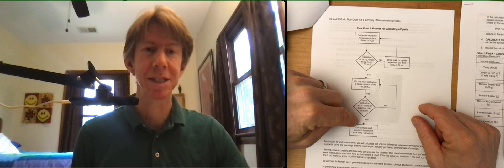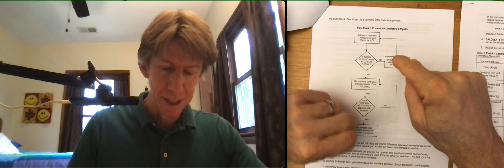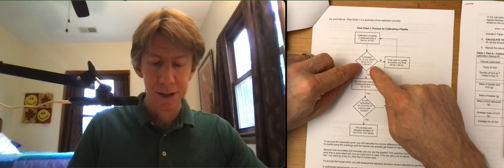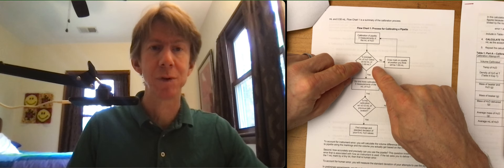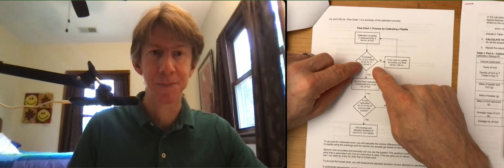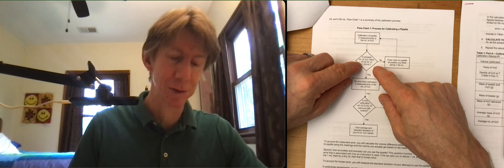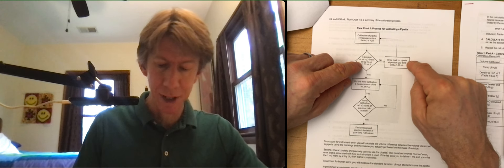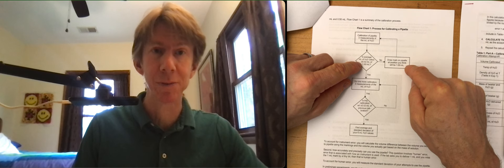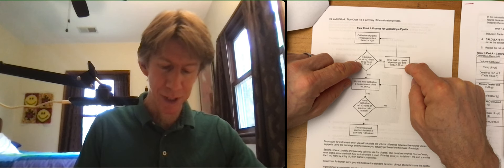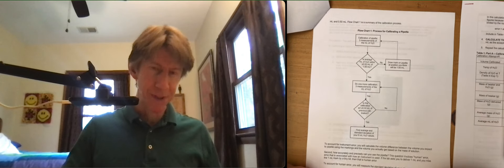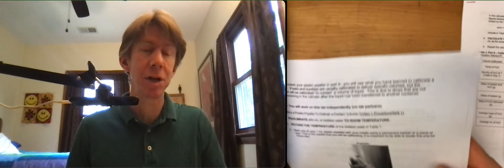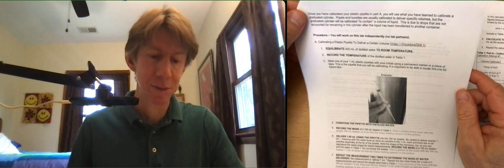Minimum number of measurements is six. If not, so if the first three are not within plus or minus 0.02 of 1.00 milliliters, that would be 0.98 all the way up to 1.02. And if they're not within that range then no. Draw a mark on your pipette at the position you think will be one milliliter, 1.00 milliliters, and do it again. And keep going until you get it right. All of this is in the actual procedure as well but flowcharts are another way to learn and understand material.